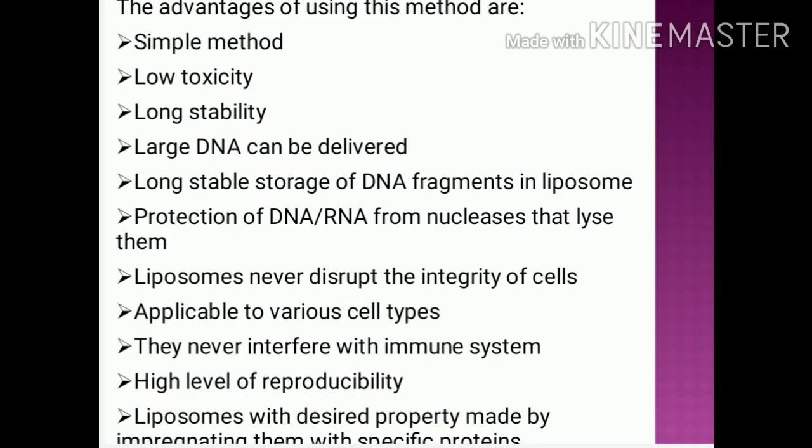Advantages of this method are: it is a simple method, low toxicity, long stability, large DNA can be delivered, long stable storage of DNA fragments in the liposomes, protection of DNA and RNA from the nucleases that lyse them, and liposomes never disrupt the integrity of the cell. It is applicable to various cell types. They never interfere with the immune system. There is a high level of reproducibility, and liposomes with desired properties can be made by impregnating with specific proteins.